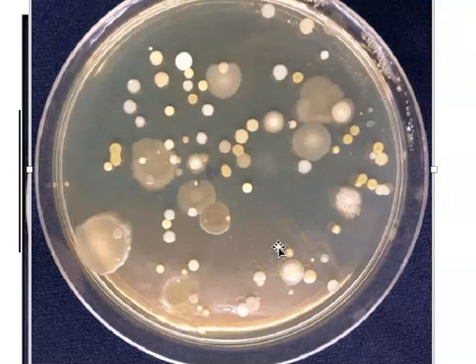Generally speaking, the colonies that belong to a single organism are going to have essentially the same size, the same shape, the same color, and so on. So all of these colonies, this one, this one, this one, this one, and this one, and this one, here and here, these are all probably the same species, the same organism. It's a little harder to tell sometimes which of the other colonies are separate species, because they can all have very similar sizes, but if you look carefully, some of these are yellow and some of them are white. So these are probably two different organisms.